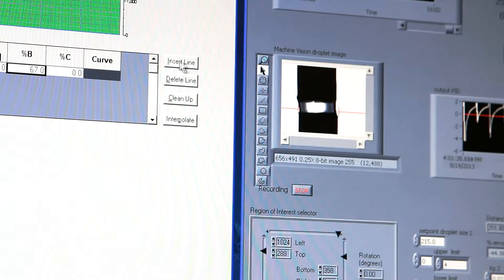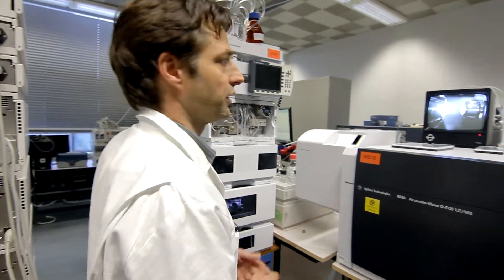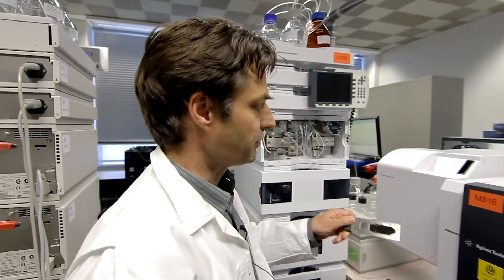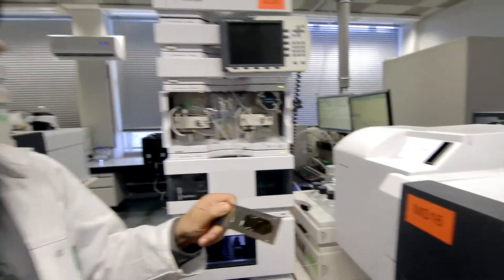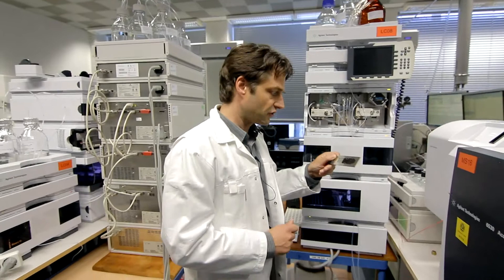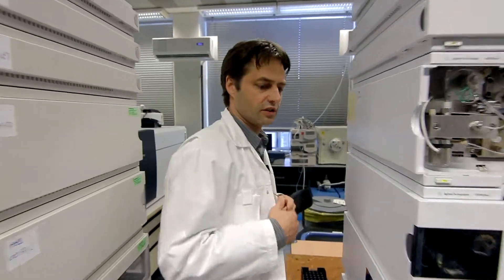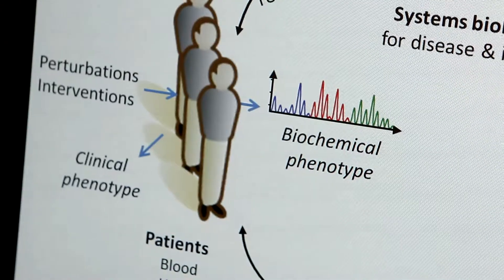Which we can then further manipulate in our system which we developed. Here you see one of our nano LC-MS systems. Here we develop methods to analyze small amounts of samples by doing the separation on this chip which can be implemented into the system. We do that in collaboration with Agilent. And for example, what we developed is a method to measure a few hundred endothelial cells and to measure the biogenic amines. And here you see the mass spectrum of one of the amines in these endothelial cells after a perturbation.